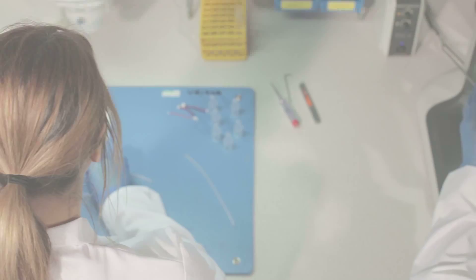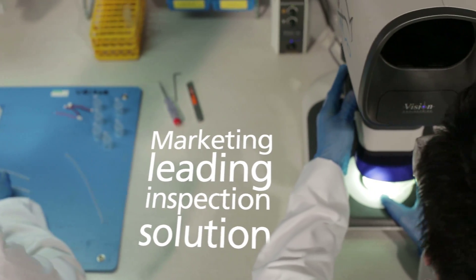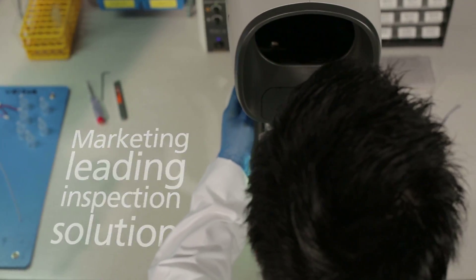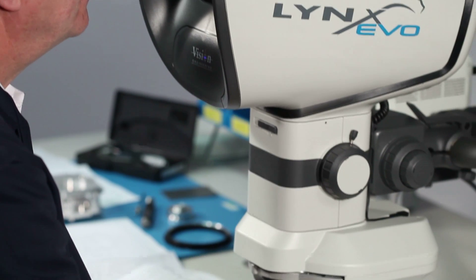Renowned throughout industry as the market-leading inspection solution, Lynx Evo is the latest generation of eyepieceless stereo microscopes from Vision Engineering.